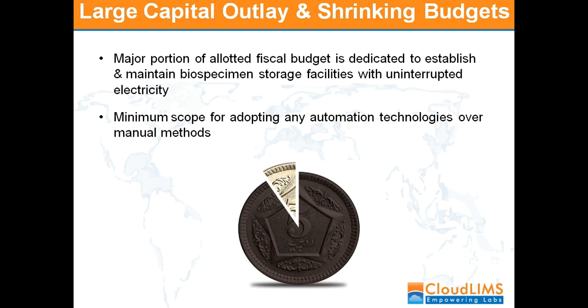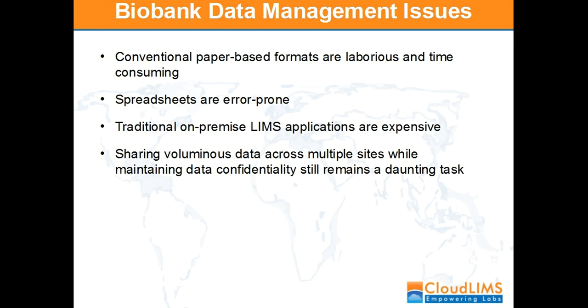So in some Asian countries, governments came forward. The biobanks of Korea, Japan and China have had rapid growth in size over the last decade due to substantial investment from governments. Now, biobank data management issues. Maintenance of good quality samples along with well documented samples, metadata and donor information is very difficult without data management software. Availability of an affordable IT solution that facilitates accreditation and fulfills audit requirements is not possible due to the shrinking budget, and it is expensive.